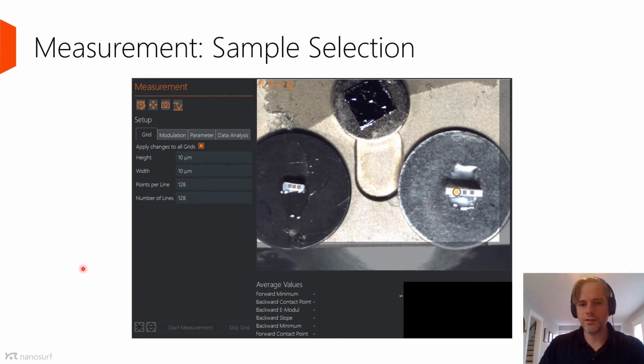So here are our samples. This is the cryotome sample. I have two samples here. The one on the left is a 2-component sample. The one on the right is the 4-component sample. In ANA software, what we get is an overview camera.